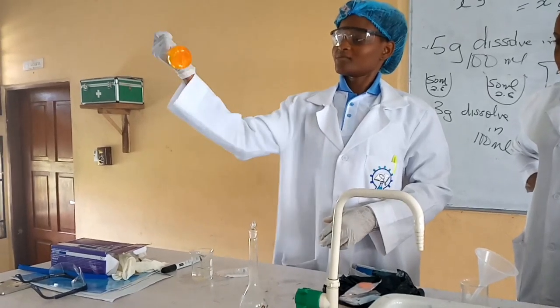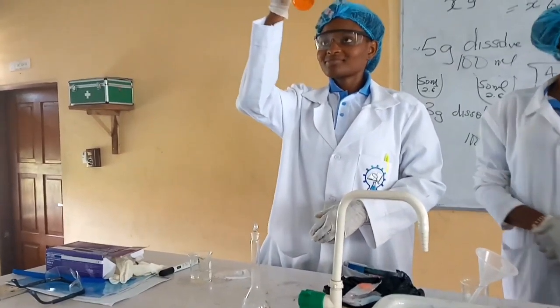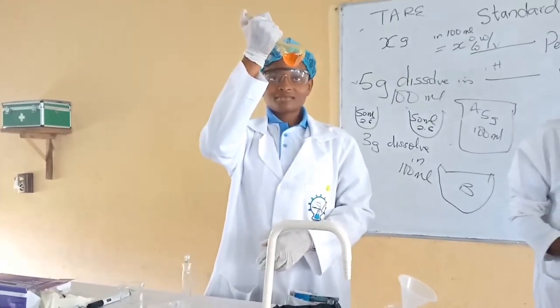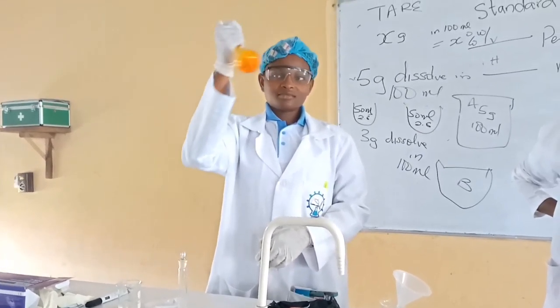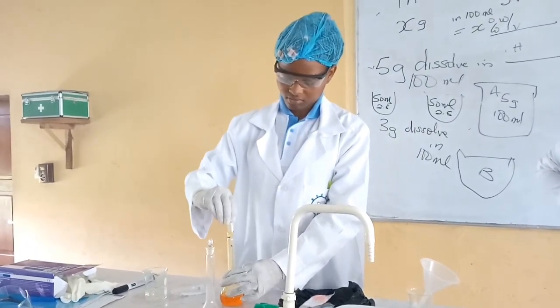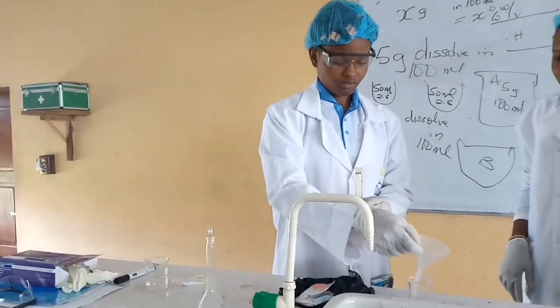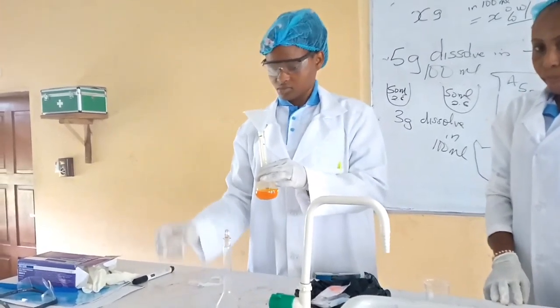Some of us will be so careless, you know, hold it like that, and you just try and pour on people's head. Ah, acid. Because we don't want you to pour acid on anyone. Are you with me? If she's satisfied that thing has dissolved, or if it does not dissolve at all, she'll still pour a little water, because some things don't dissolve faster. Until enough water, so she'll put a little.